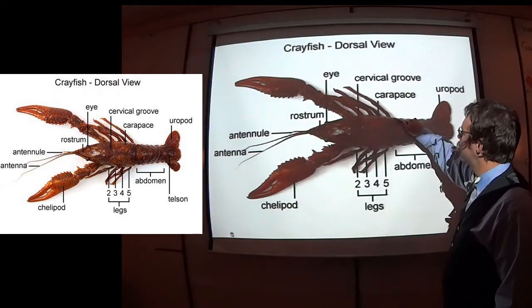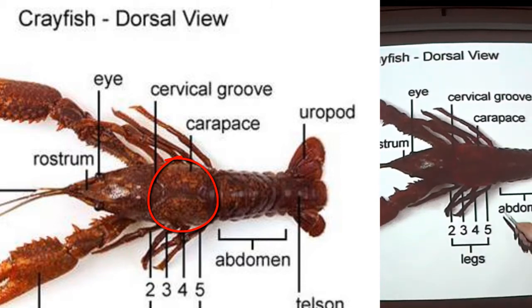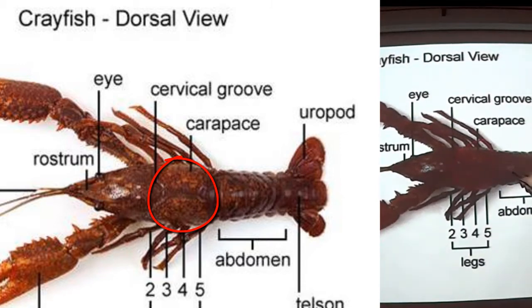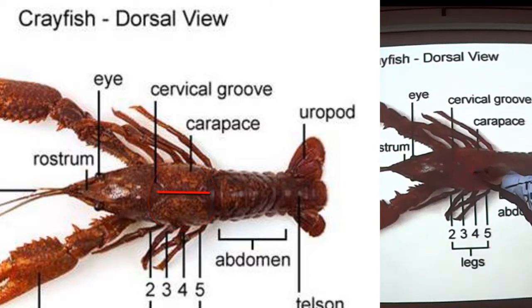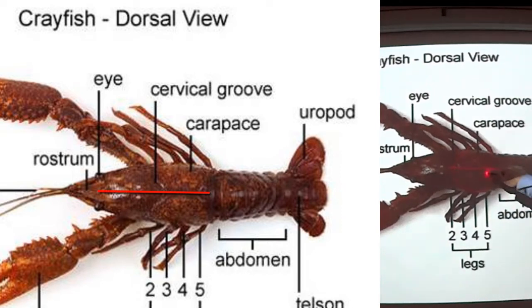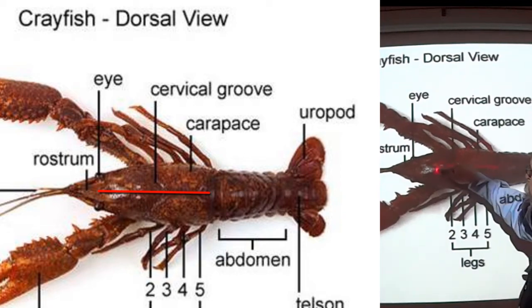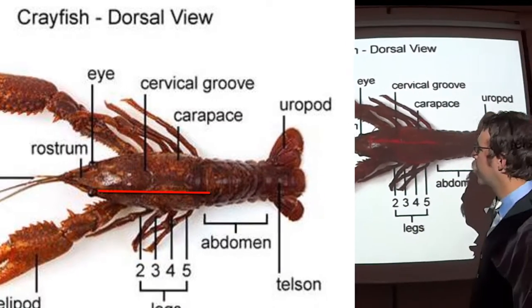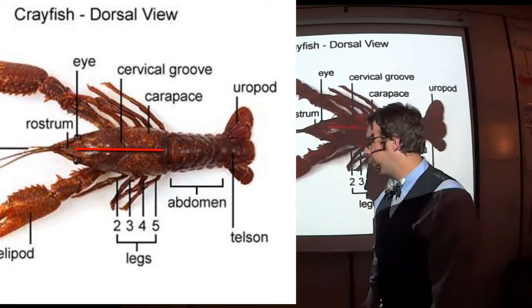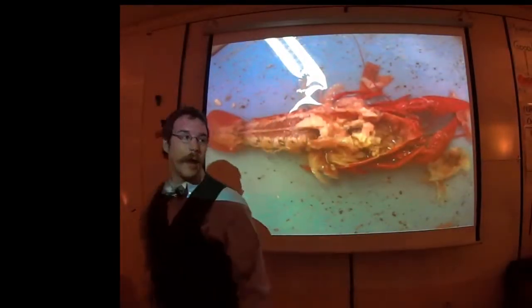You're going to slip the scissors in — there's a little space between the carapace, which is the chest-piece region, and the abdominal region. Just slip the scissors inside there and make your cut right up the middle. Then make your two supporting cuts and remove the two pieces of crayfish exoskeleton.